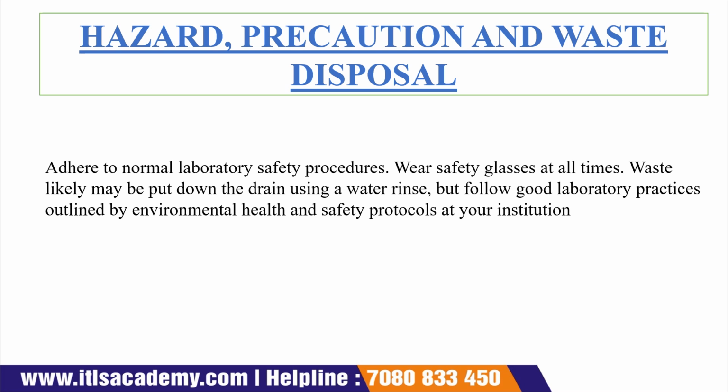The waste generated during this experiment can be drained out using a water rinse, but we also follow the good laboratory practices outlined by our environmental health and safety office, and the other safety protocols given by our institution.